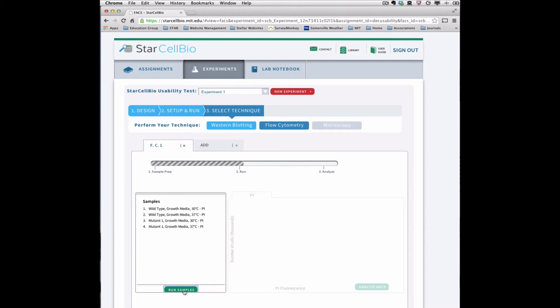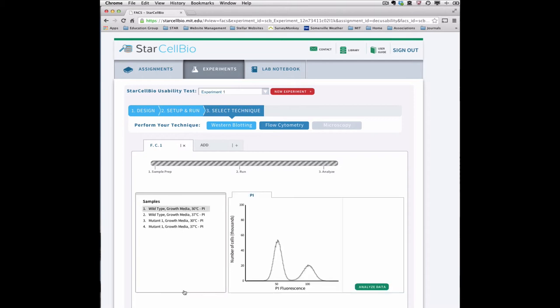The flow cytometry histogram for the first sample in the Samples menu will be displayed in the small tabbed window on the right side. In this case, the histogram represents the number of cells for each level of PI fluorescence.